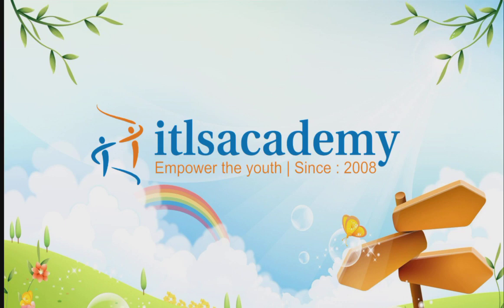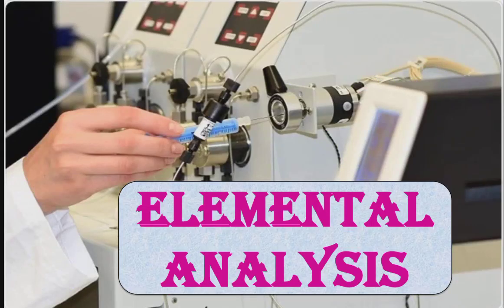So today in this lecture we are going to study elemental analysis. This elemental analysis is a broad topic of analytical techniques. In this particular lecture we will understand what elemental analysis is. We will also learn about different types of elemental analysis, and we will see the applications of elemental analysis in different fields of industries.